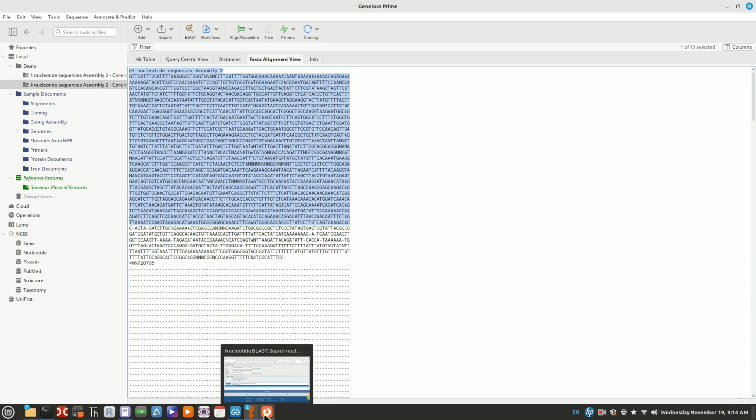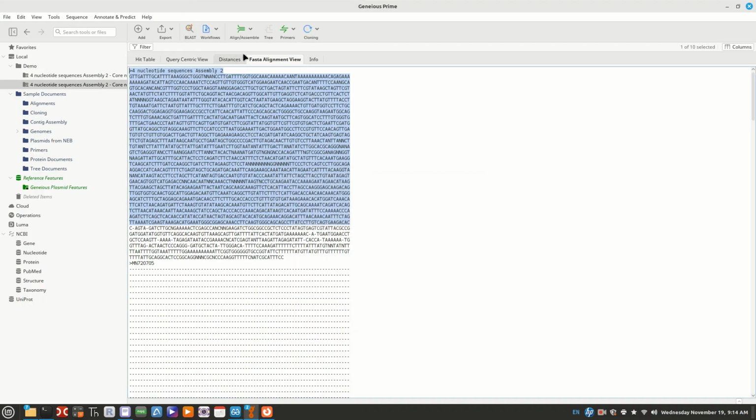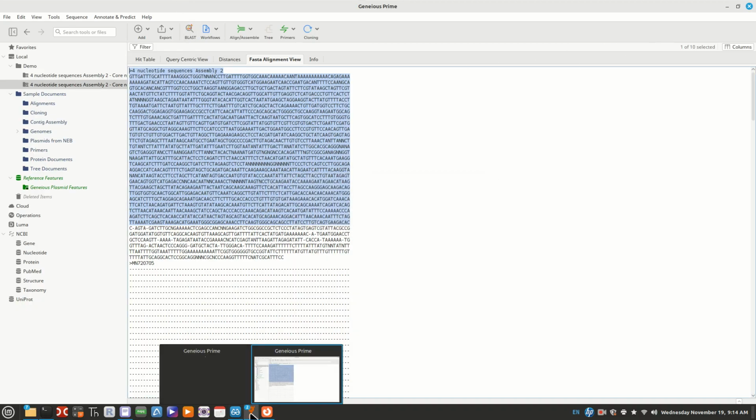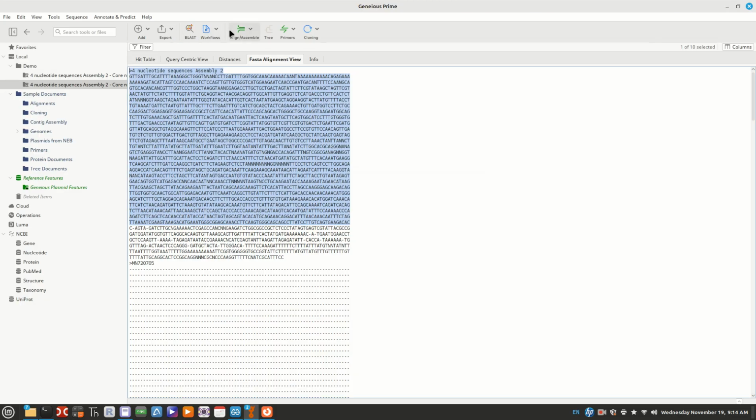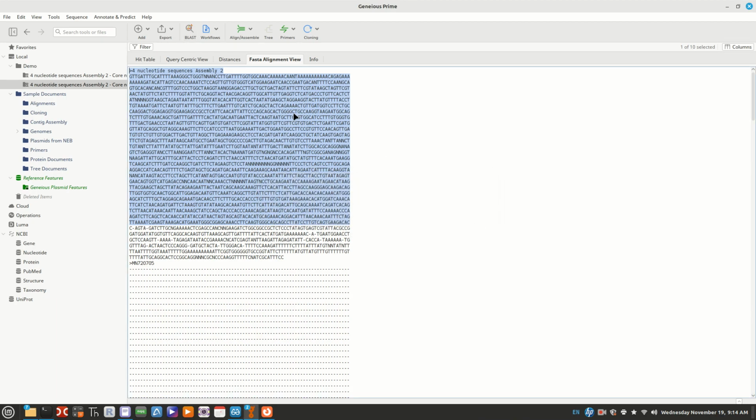And I'm going to go back up here to Blast. Do I already have it open? No. So this sequence. Okay, well, we want to go to Blast, and it would send us there from here.